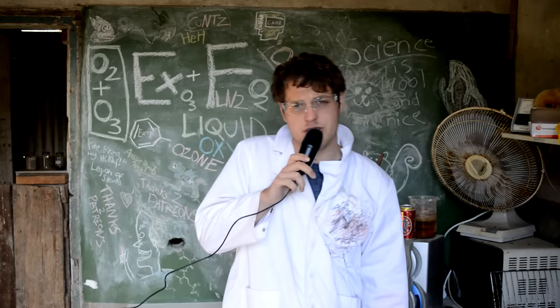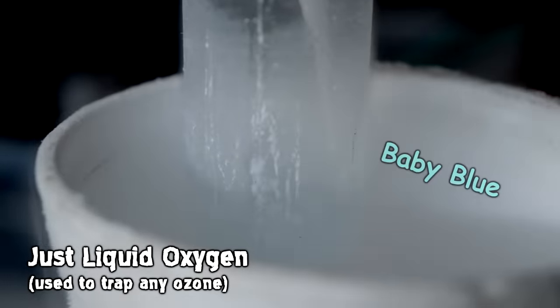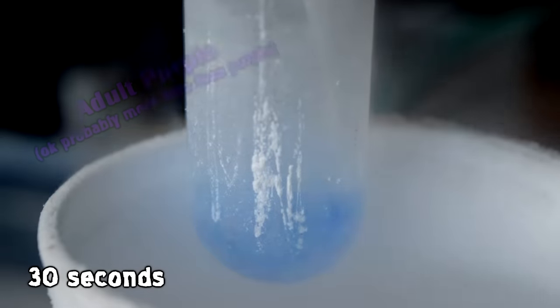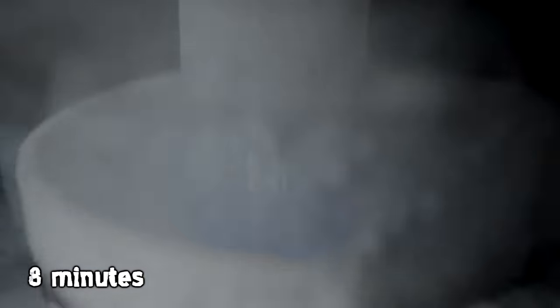Now, I know my ozone generator has quite a low efficiency, but if we do generate any ozone, we should see that pretty clearly because oxygen is blue, but ozone is purple. So we collect some liquid oxygen first, turn the generator on, and sure enough, within about 30 seconds our mixture graduates from a baby blue to an adult purple. And if we keep the generator running for a couple minutes, we can see it continues to go more a purple color. So we actually are condensing liquid ozone.